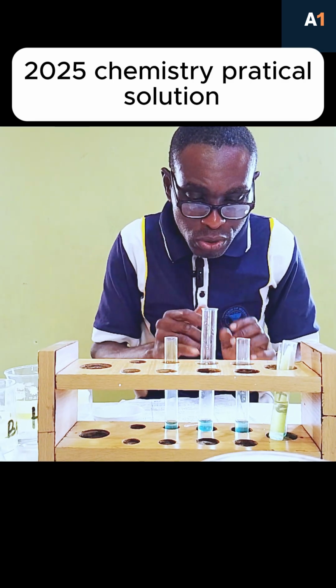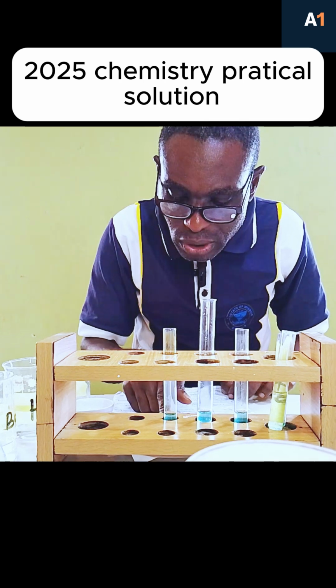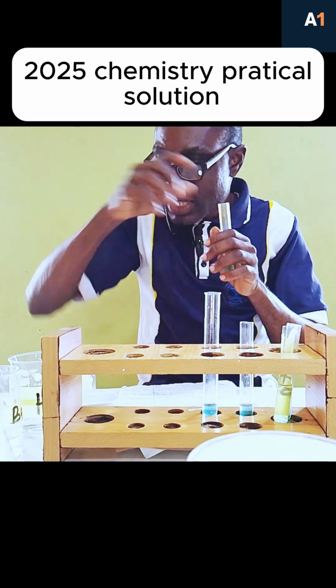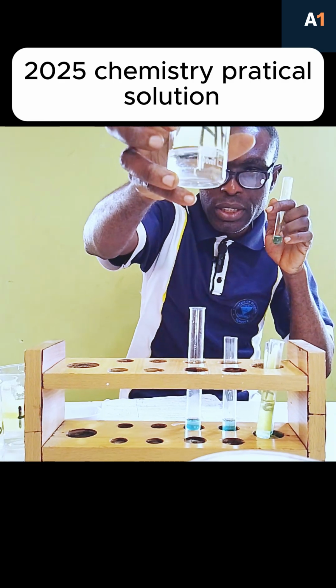Now I'm following the question. The second question says to the second portion add aqueous ammonia in drop and excess. So this is the second portion now. Now look for the ammonia. This is the ammonia. As you can see, this is the ammonia.